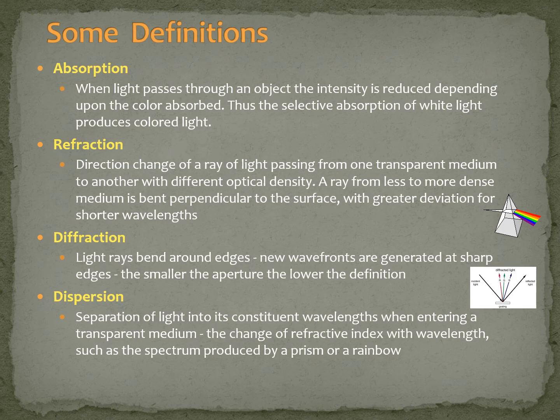So furthermore, we should have a good notion of all these characteristics of light. This is just a summary of the characteristics I was using today. There's more that we have no time to talk about, but just by using the absorption of light, refraction, diffraction, and dispersion, we can have some very good detailing on our samples.